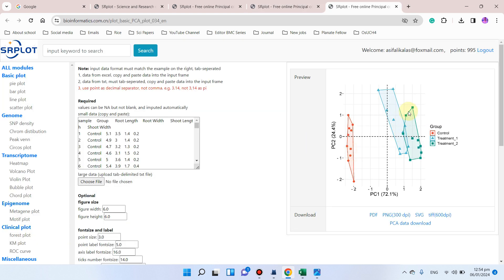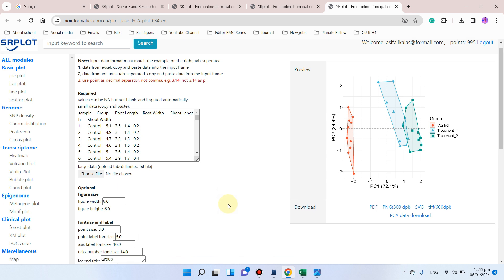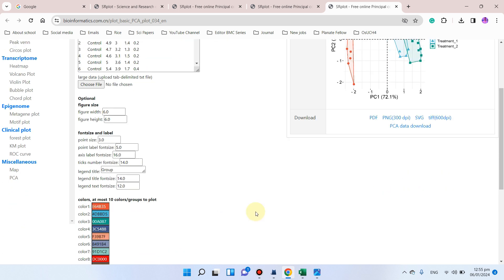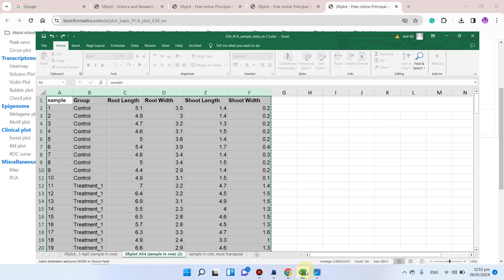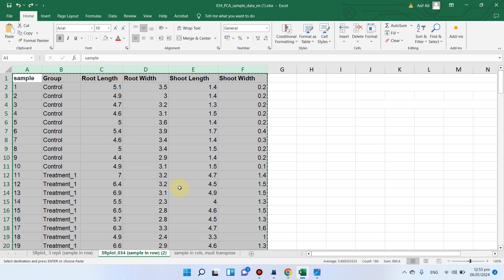Here you can see now we have the outer convex boundary displayed on the PCA plot. We can download it as PDF, PNG, or any other format we want.